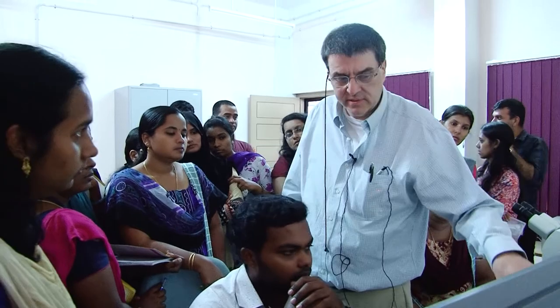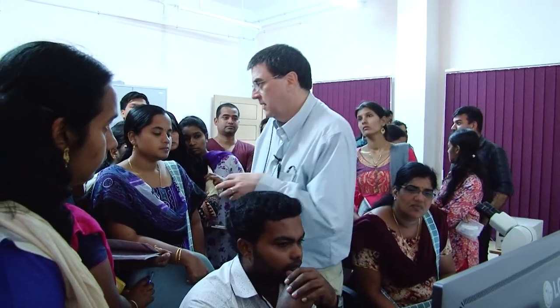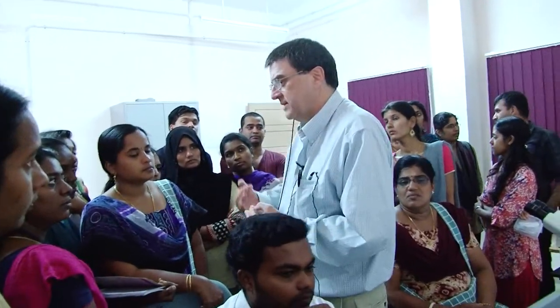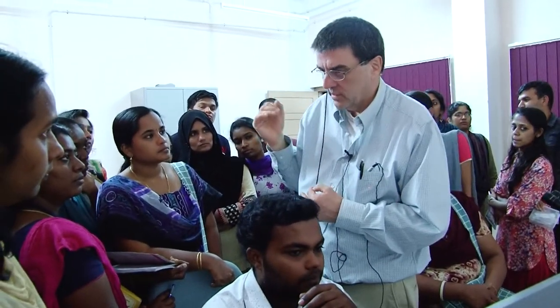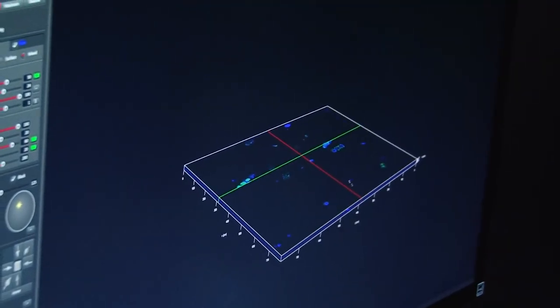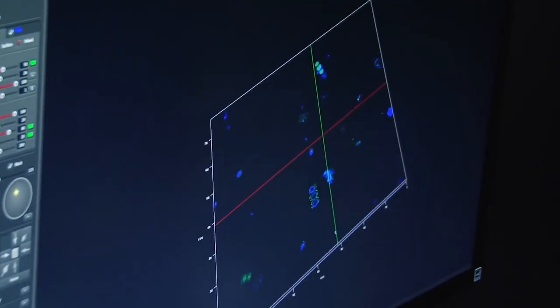But the trick to using an instrument like this really is averaging, because it'll take a little longer, but you get rid of the noise. Okay, and the whole idea is to get nice signal, low noise, okay? Okay, so let's have somebody else, yeah, nice 3D projection, looks good.